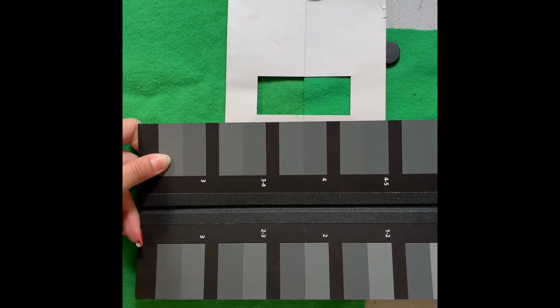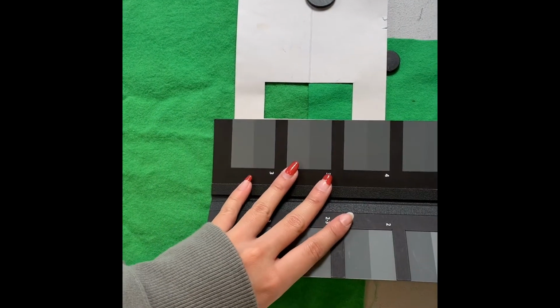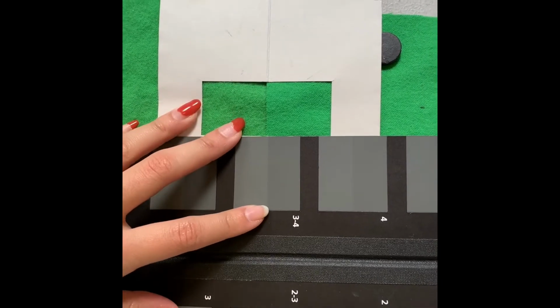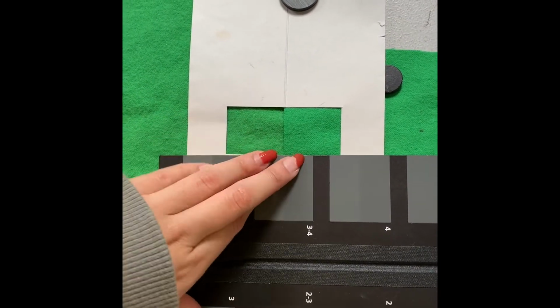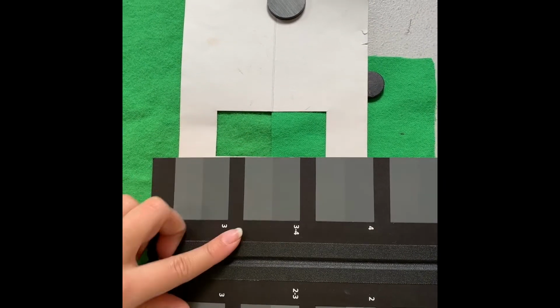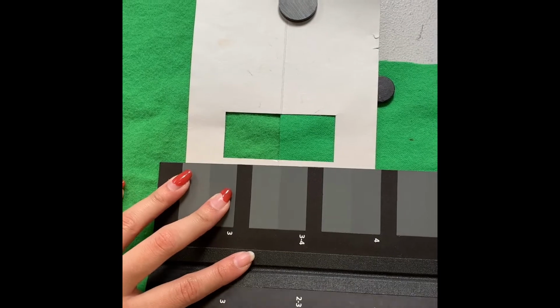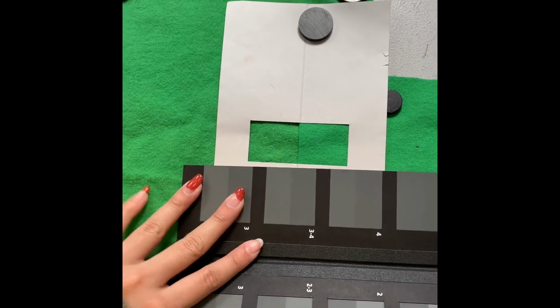And as you can tell, with the AATCC colorfastness rating scale grayscale, we were able to determine that our fabric scored between a 3 and a 4 by comparing our sample that was affected by the weathering to an unexposed sample that we had previously. So as you can tell, there's a significant difference in the color of our fabric by its lightness and hue.